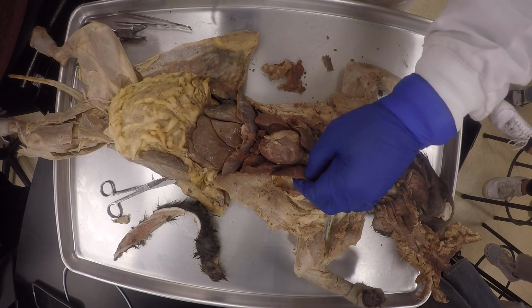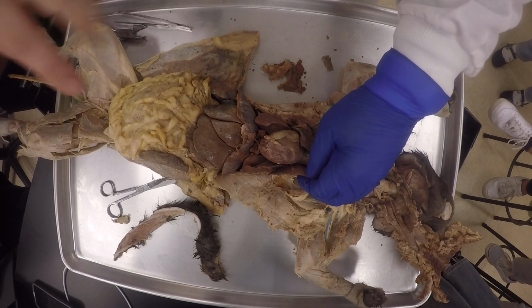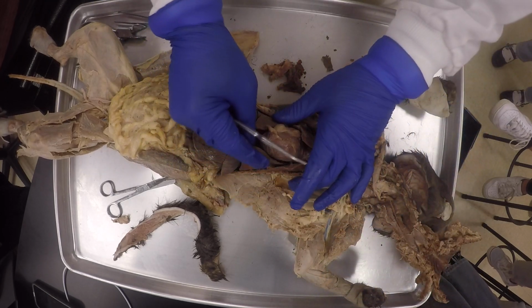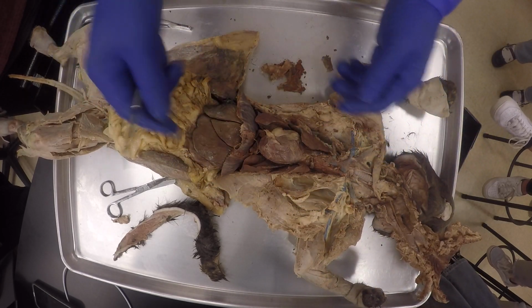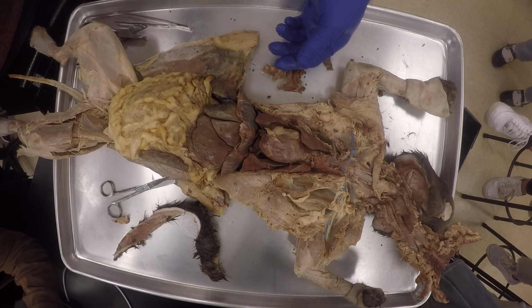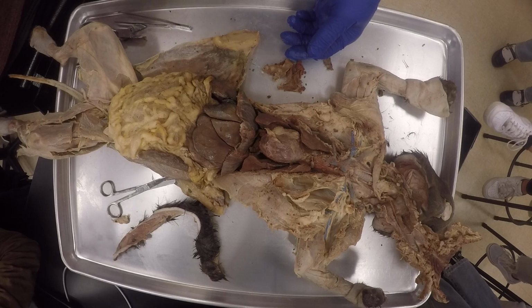The pictures are pretty, but they're hard to see, because they don't wrap. Once you know the middle one, you're going to know this is the cardiac lobe, correct? You understand? So this is the cardiac lobe, and that would be the apical lobe.